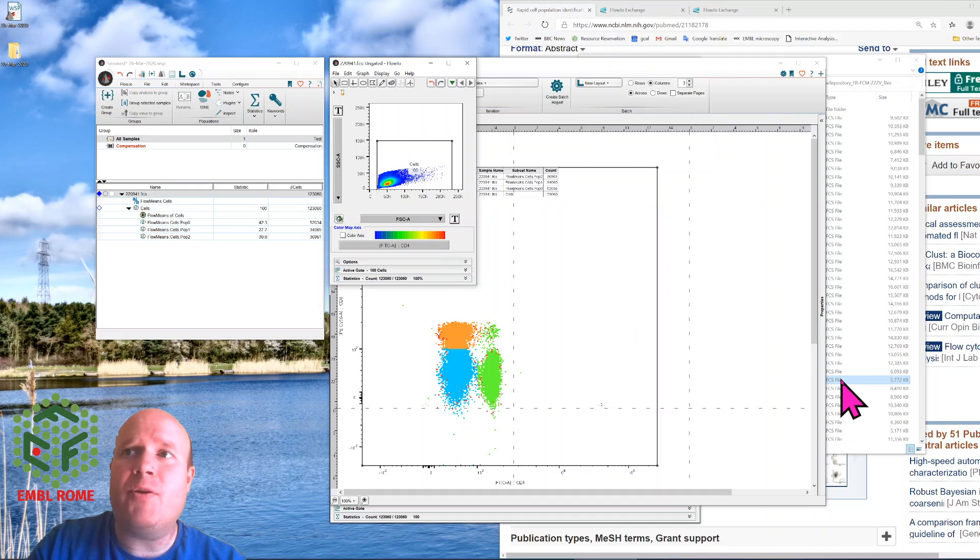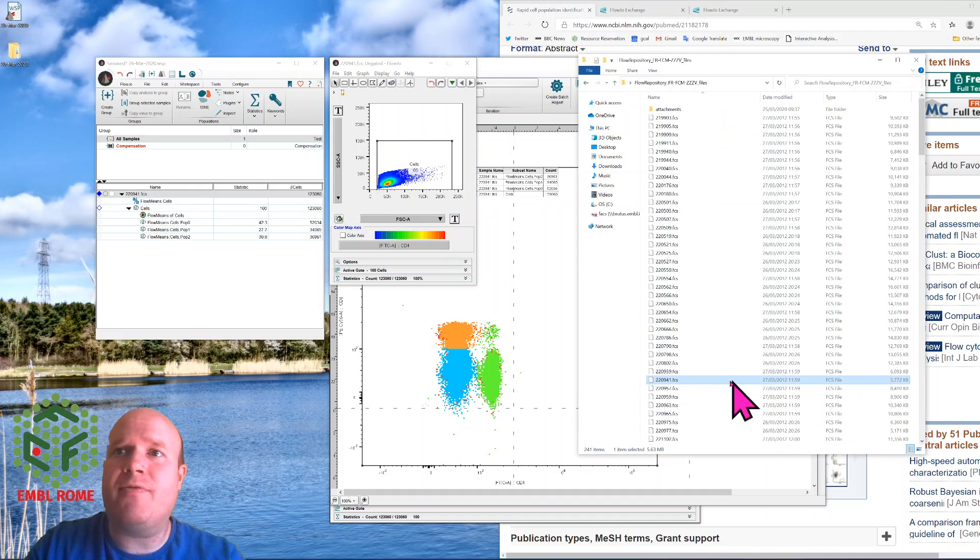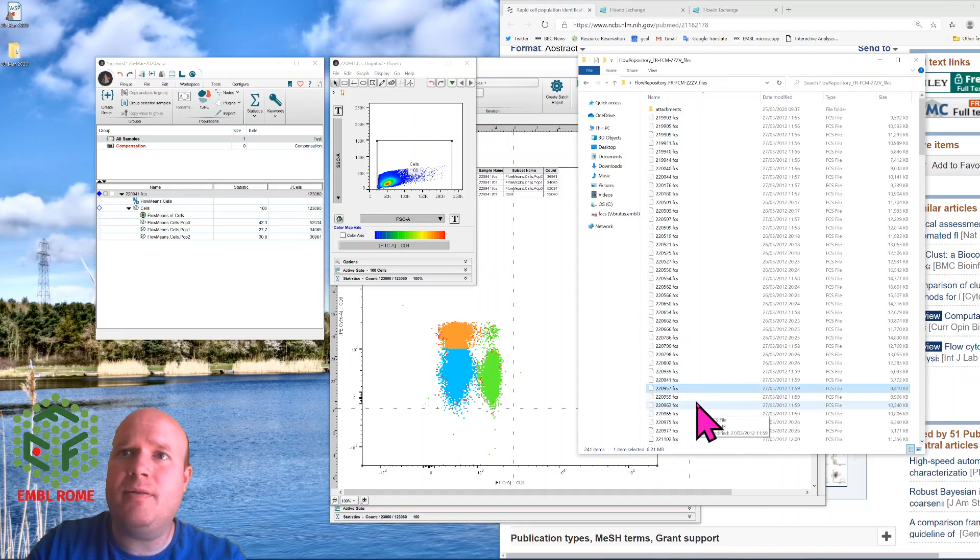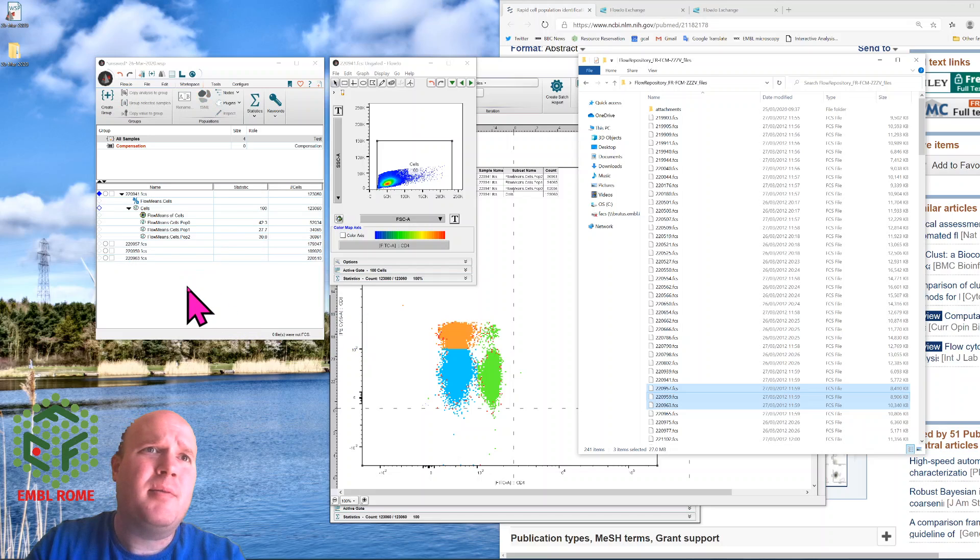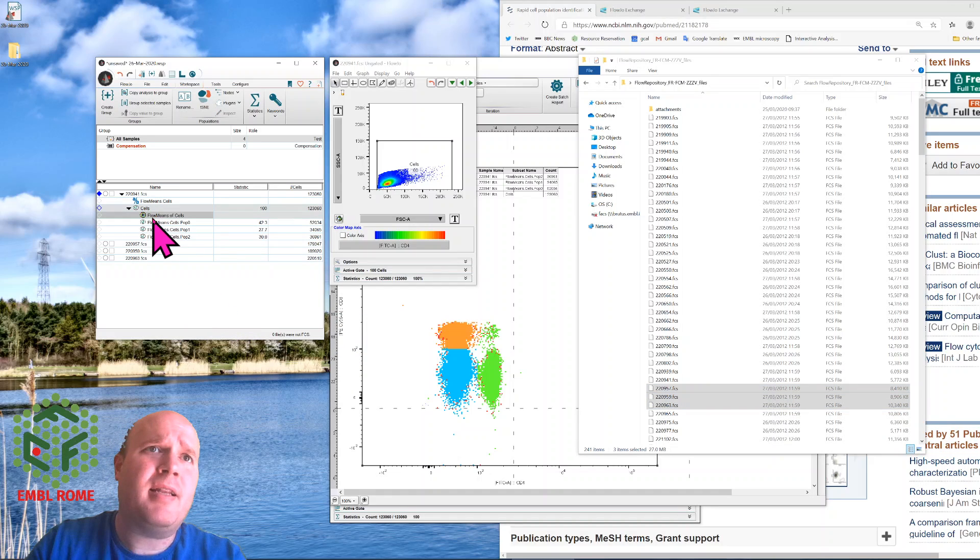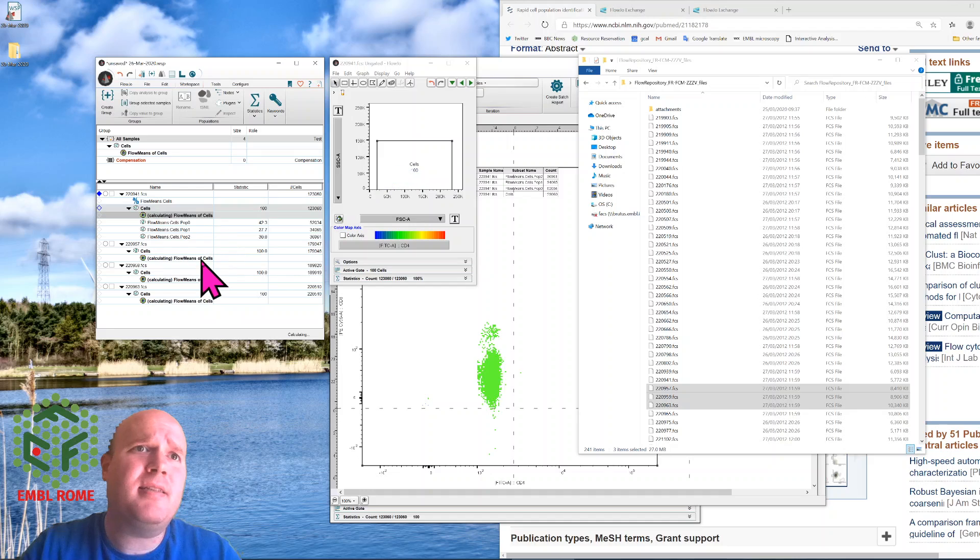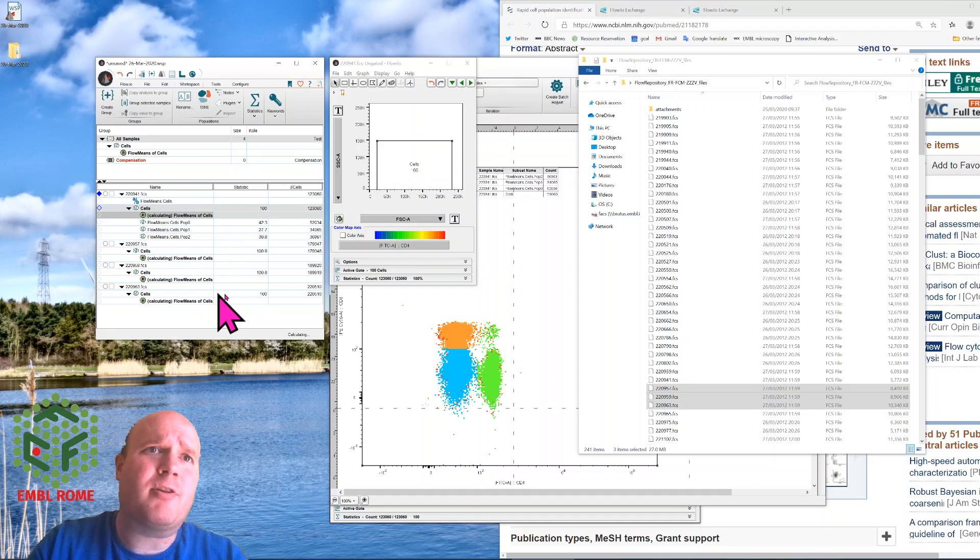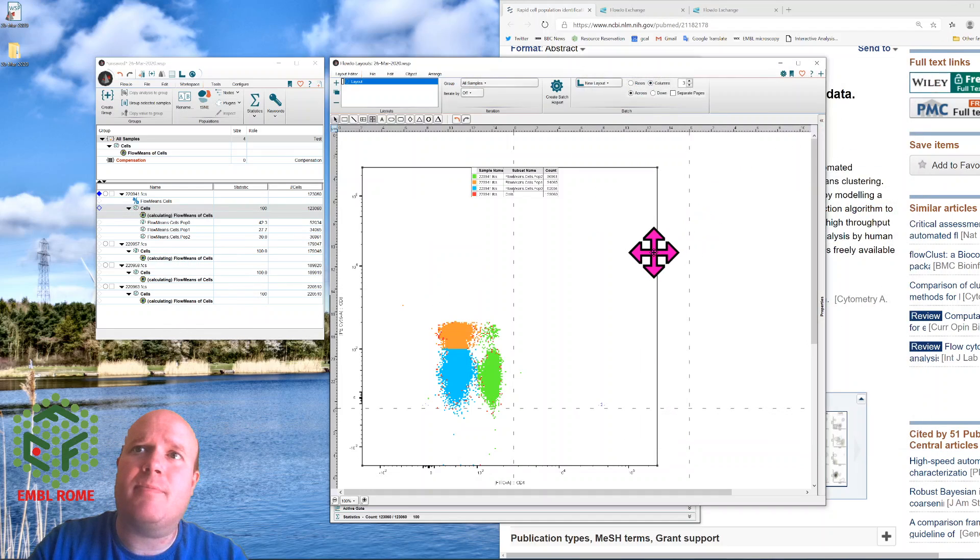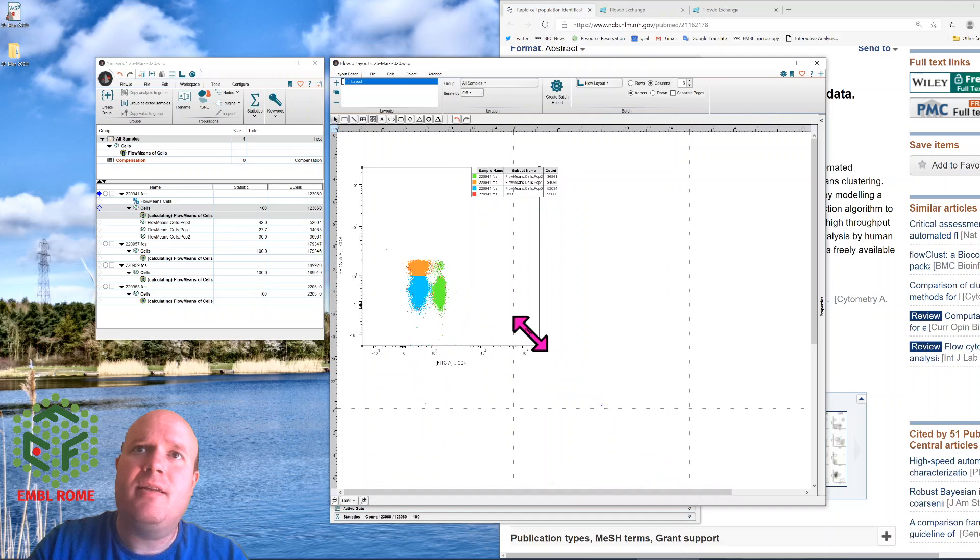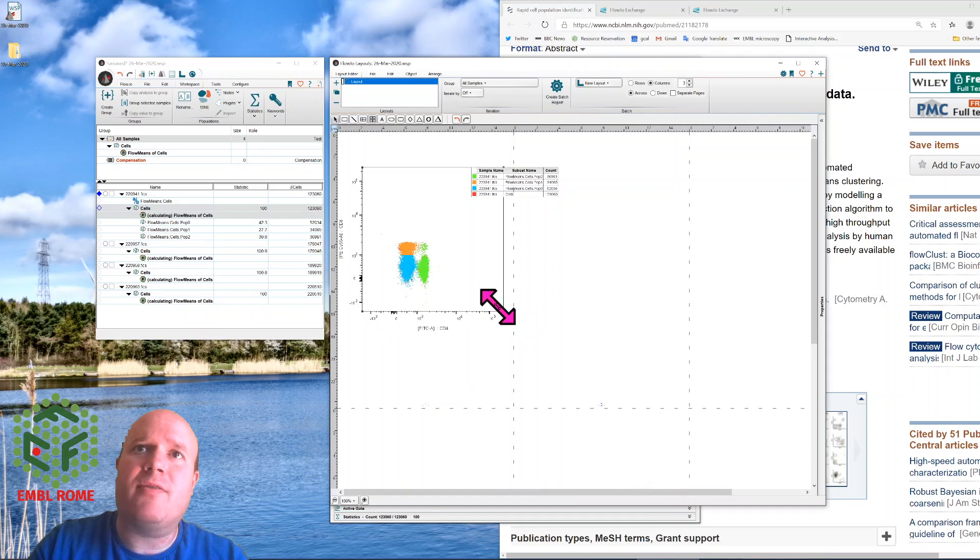If you want to do it to multiple files, it's fairly simple. You just highlight multiple files, bring them in, highlight the FlowMeans and the cell gate, bring them across, and it'll do all the calculations for all of them at the same time. So the final caveat for using FlowMeans is it doesn't always choose the same clusters in all the different populations.